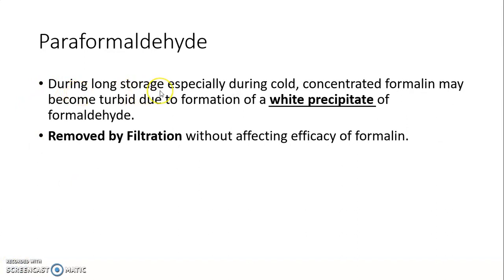During long storage of formalin, especially during the cold, concentrated formalin may become turbid due to formation of white precipitate of formaldehyde. It should be removed by filtration without affecting efficacy of formalin. So it is removed by filtration and it will not affect the efficacy of the formalin. These are paraformaldehyde.